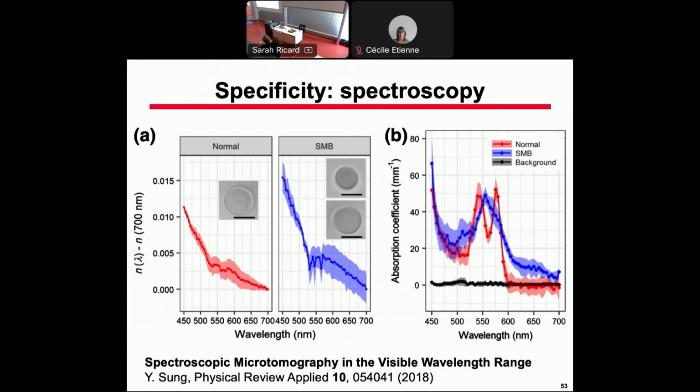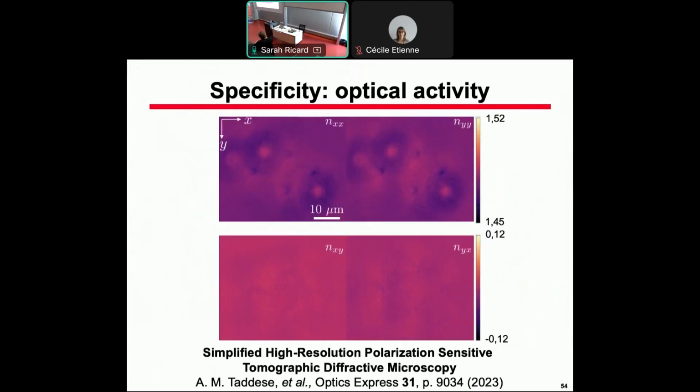Lots of information, especially from this part. In the commercial implementations of tomography presently, they just neglect absorption. So when you see red blood cell images from a microtomograph working with a green laser at 532, it's called the red blood cell and not the green blood cell. It must absorb green light. But it's just neglected up to now in commercial implementations.